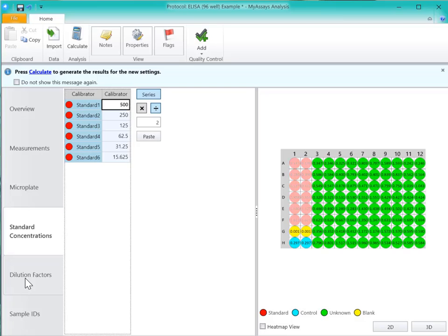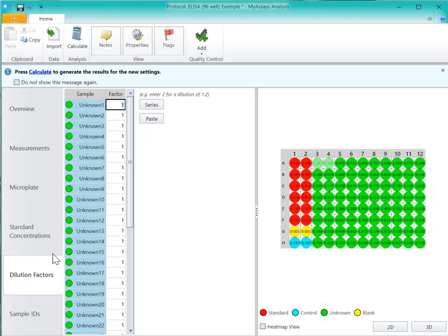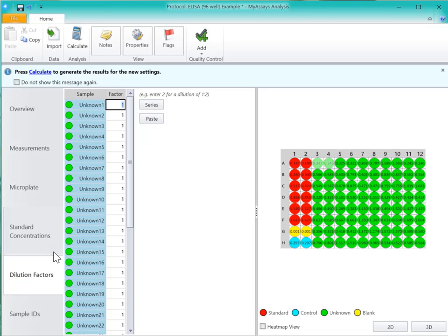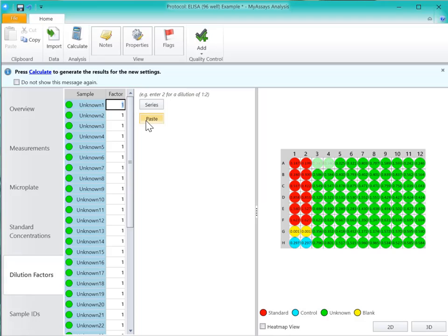On the Dilution Factors tab, my unknown 1 and 3 have been diluted one part sample to one part diluent, so I'll enter 2 as the dilution factor for those samples.